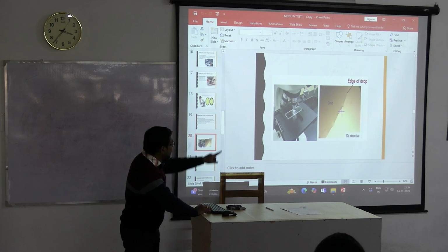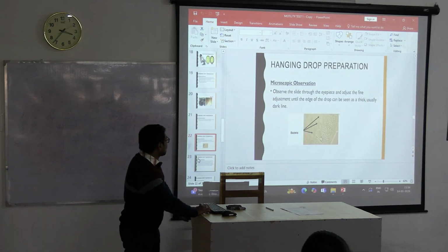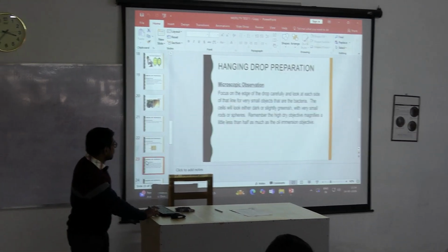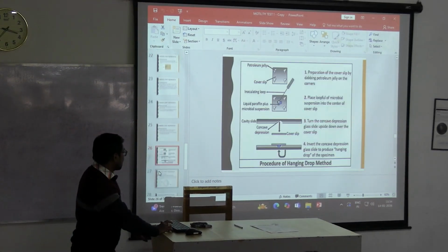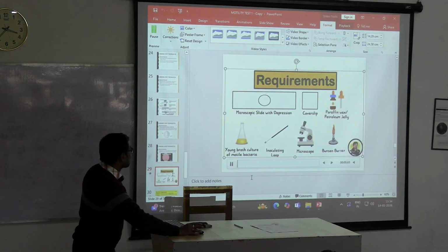Like that, we have to focus on the edge, and we will find a picture like this. We also have a video on how to perform it.